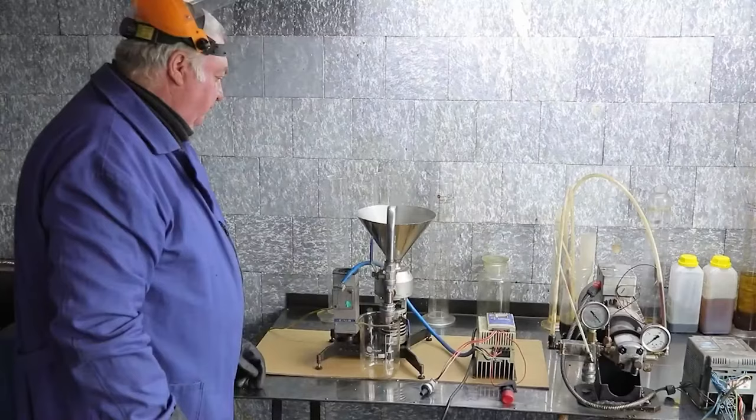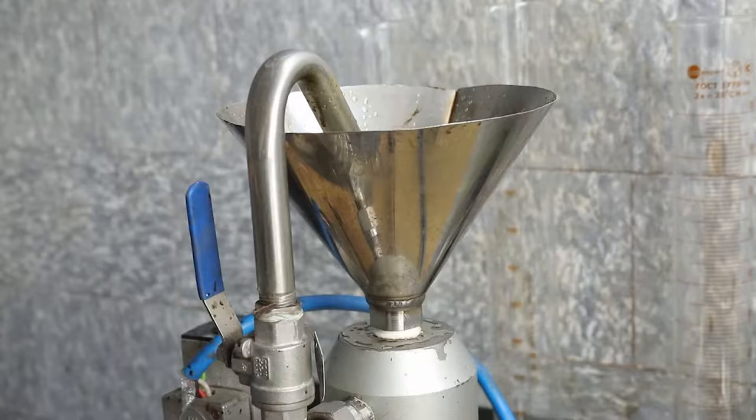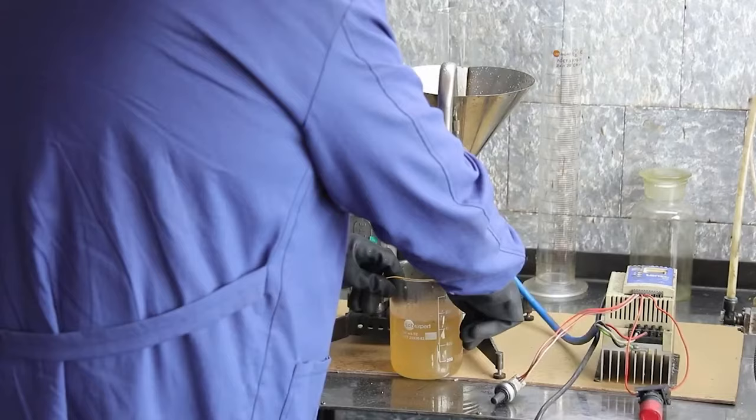Having warmed up the colloid mill, we turn it off and drain the water. Now, we've got everything ready for obtaining a bitumen emulsion. We turn on the colloid mill again.